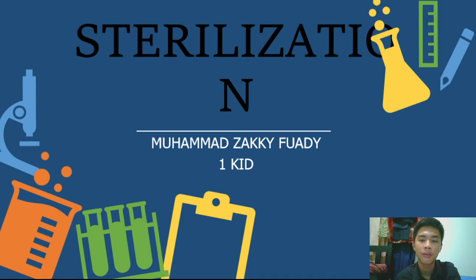As you can tell from the topic of my presentation, the topic I would like to speak about today is sterilizing laboratory glassware. First, I'd like to outline my presentation.